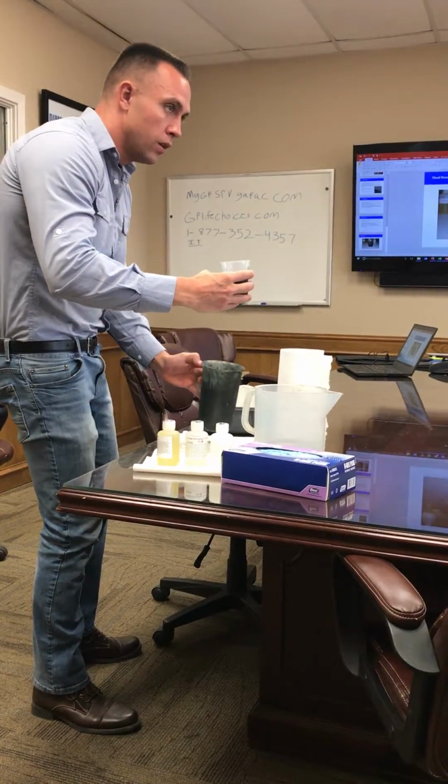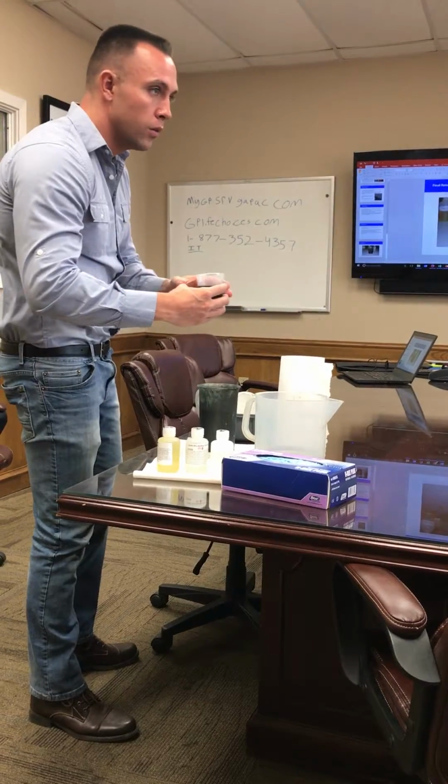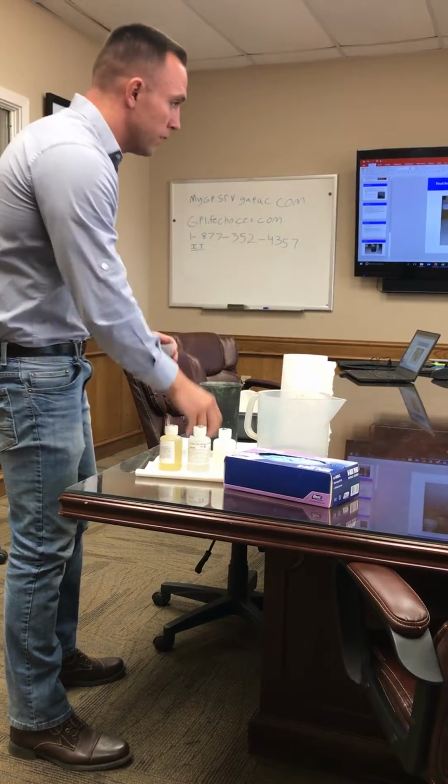Joe, have you done a jar test before? I worked with him. With Mark? Okay. So I know you two have, for sure.